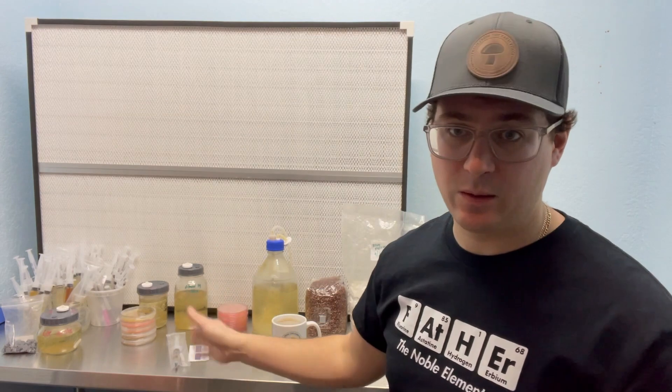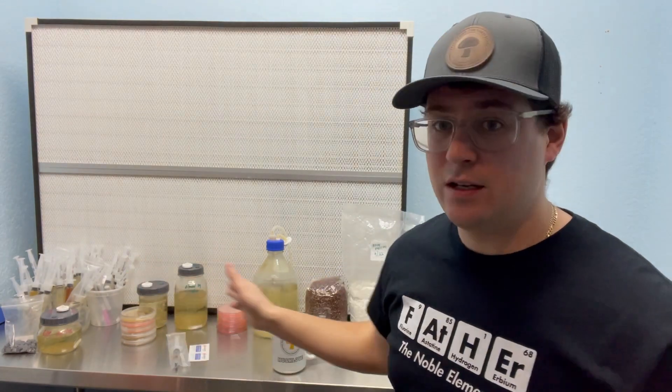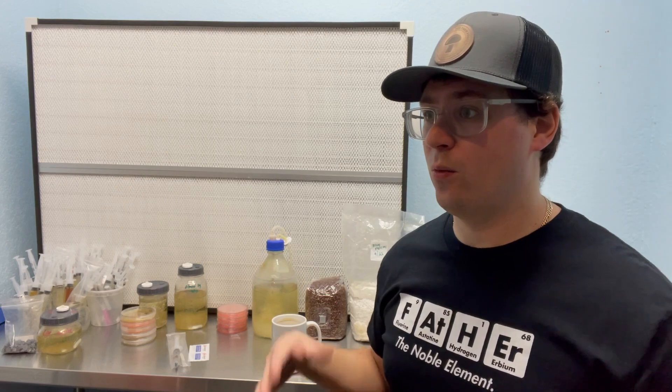After you get your liquid culture, there's a few different things that you can do with that liquid culture. And that's where aseptic technique comes into play. So what is aseptic technique? Aseptic means without life, and then technique is a system to achieve that goal. So it's the system that you use to achieve zero life process.